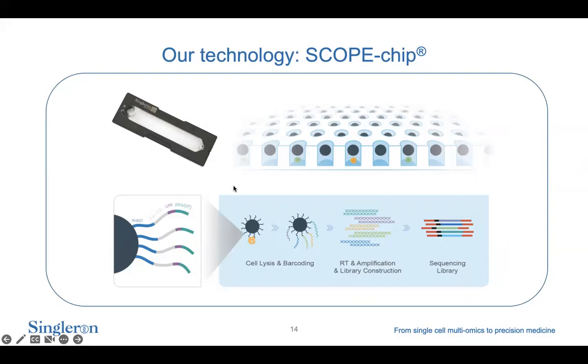Once this step is accomplished, you load the barcoding beads, again using the opening on one side of the chip. The beads are labeled here as black circles. You get one barcoding bead falling into each microwell. What you are aiming for is to get a single cell and a single barcoding bead to meet in one microwell. This is the situation that you want to achieve.